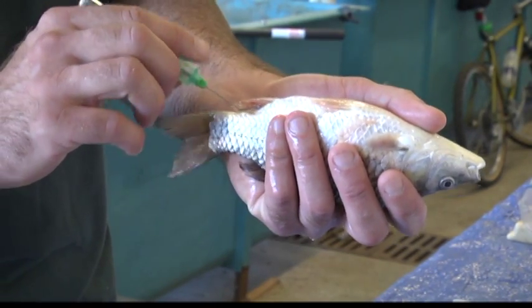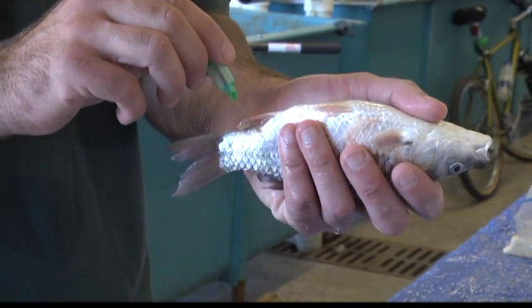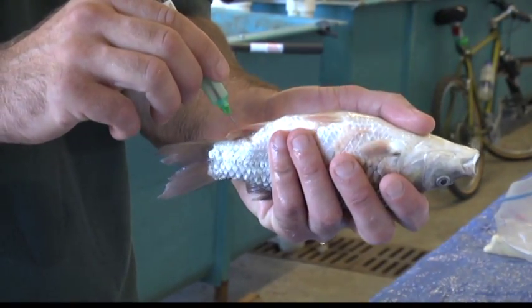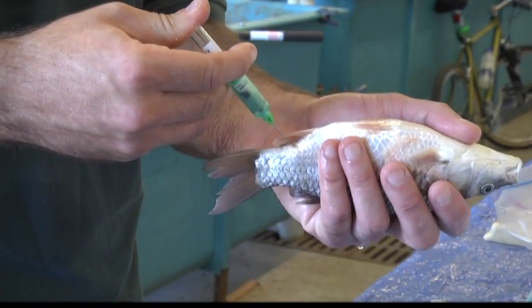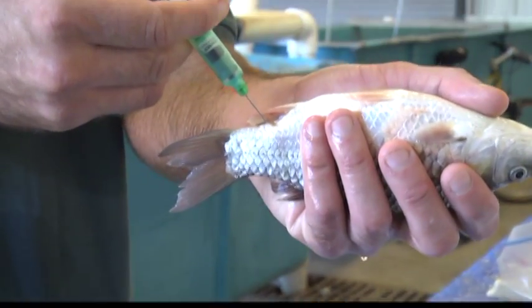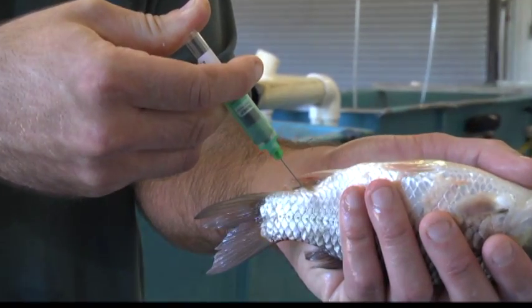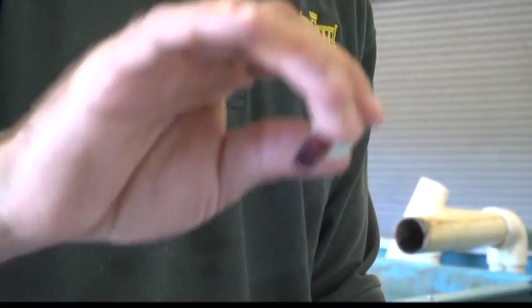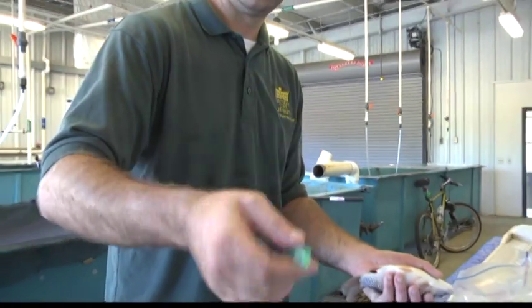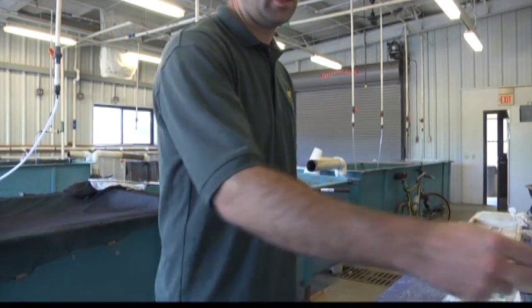We'll go underneath the scale, straight down. You can feel the vertebrae there — it's easy to bounce off the vertebrae, but I'm on it right there. You can see how it's kind of bottomed out. Push the needle down, push the vacutainer down, and you can see the blood drawing up. We don't need a whole lot of blood. Then you want to invert it several times so that you make sure the blood mixes with the lithium heparin. After that, we'll label the tube and place it on ice.